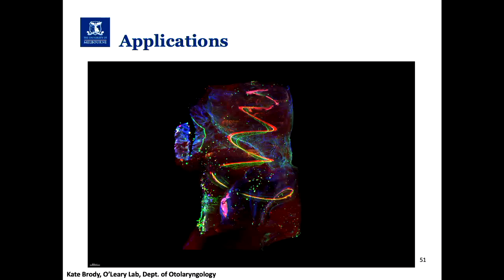One of the downsides is because we're taking thousands and thousands of slices through this, the data sets can be quite large as well. So this is probably a 30 gigabyte file just for that single acquisition.